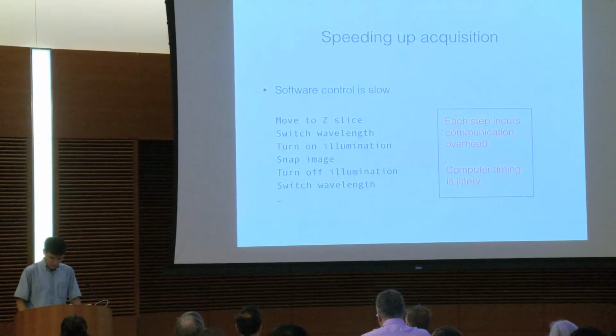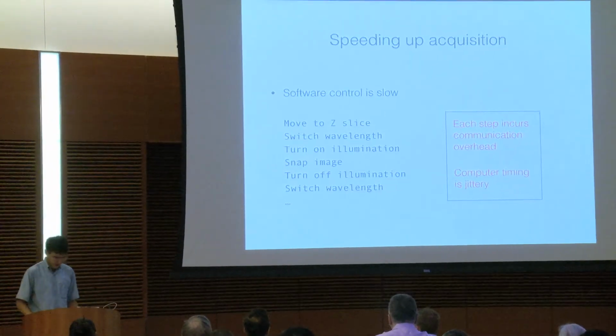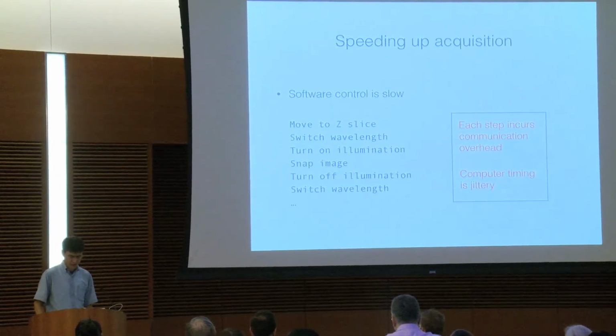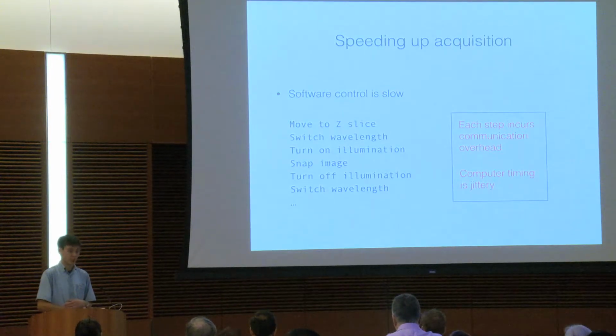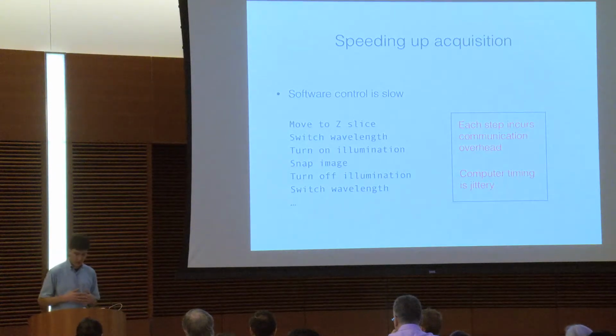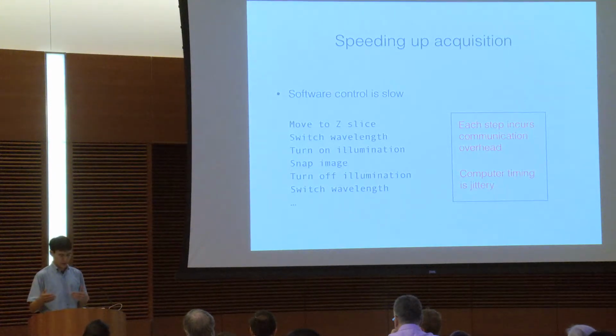The following few slides are not about plugins, but a couple of advanced aspects of µManager. One thing I want to talk about is the support we have for acquiring data at higher speeds. All the acquisitions I've been demoing so far are run in software. And what that means is that the computer is sending out commands for each movement of the devices. So for example, if you're doing a multi-channel Z-stack, the computer will send the stage a command to move the Z position to a particular slice, it'll send a command to the illumination devices to switch to a particular wavelength.